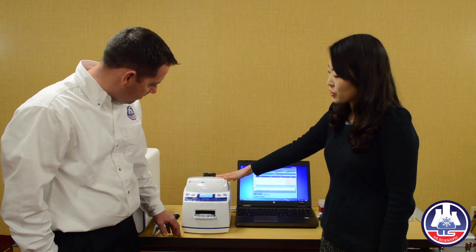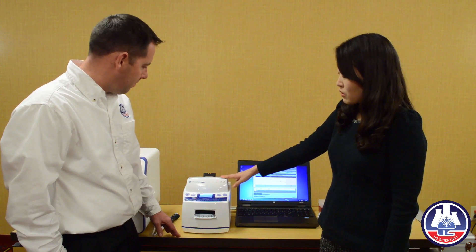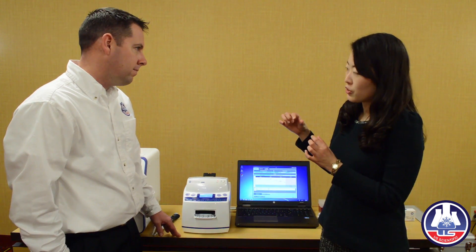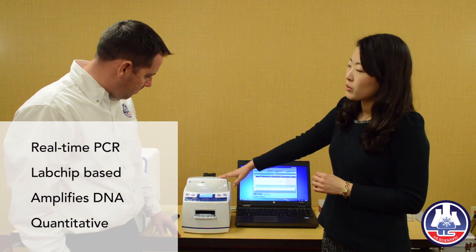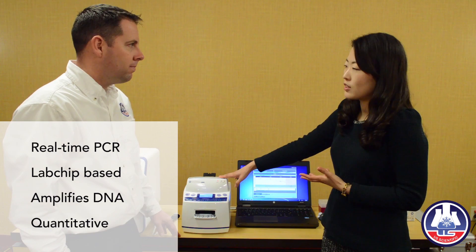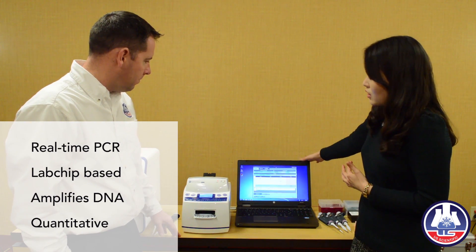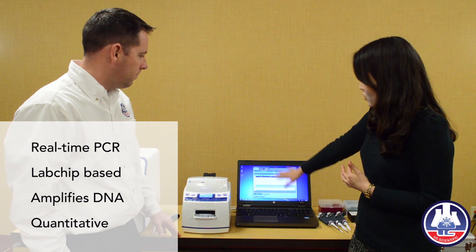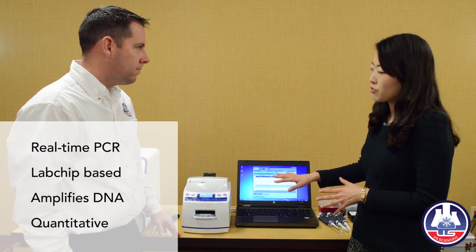This is our real-time PCR machine. It looks pretty and small. It comes with a little chip — a PCR chip. Real-time PCR is for amplifying your DNA, so you can see your DNA quantity a lot with the signal. This laptop comes with this instrument. There is our software — this software controls all the instruments.